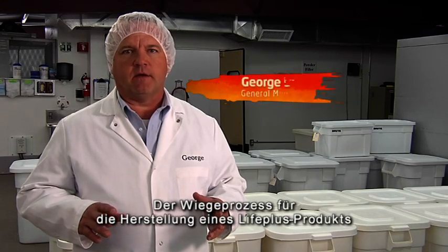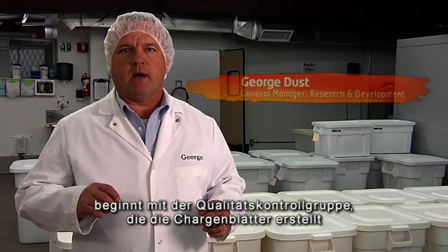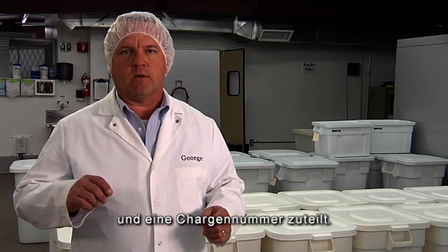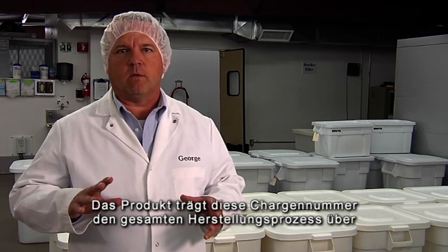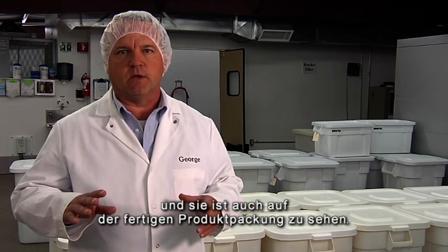The weighing process to make a LifePlus product begins with the Quality Control Group issuing the batch paperwork and assigning a specific lot number to that batch. That lot number will follow the product all the way through the manufacturing process and wind up on the bottle of finished goods when they're done.